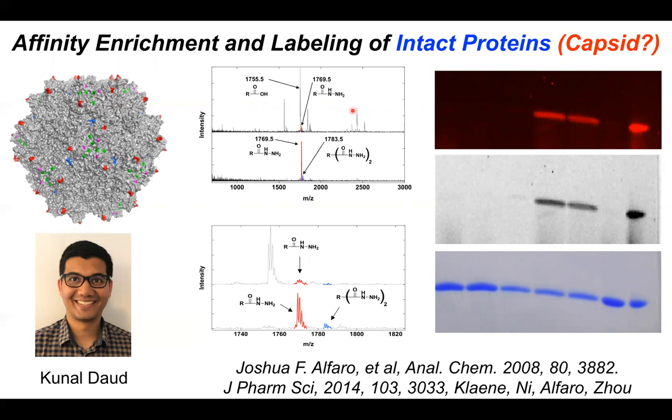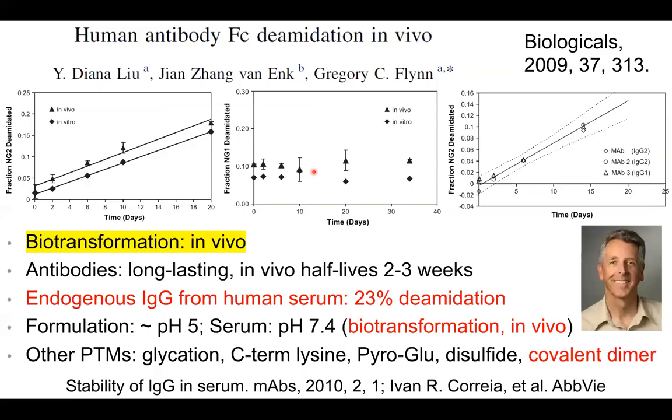in the capsid, ideally. And one way we can do that is to use a chemoenzymatic way to label those proteins. Again, without going into detail, we have developed several ways to label protein. For example, here, we have a protein that we can fluorescently label. We can also affinity enrich it for subsequent analysis. I'll be happy to share more details.